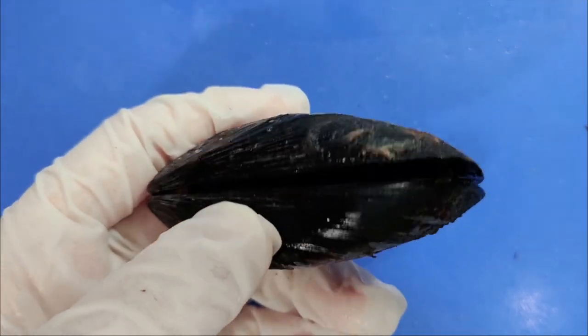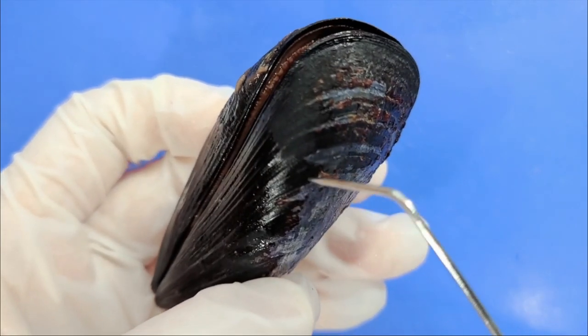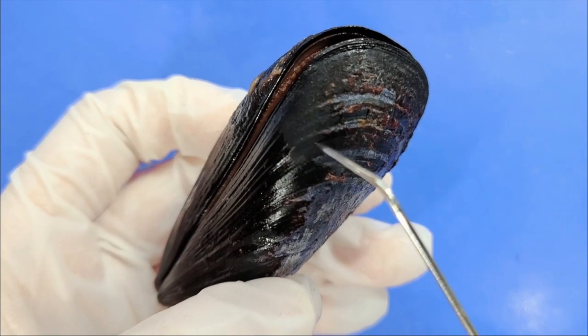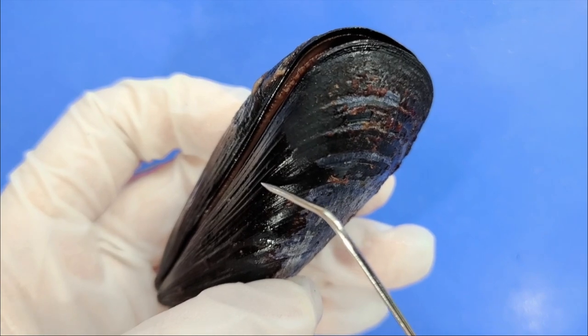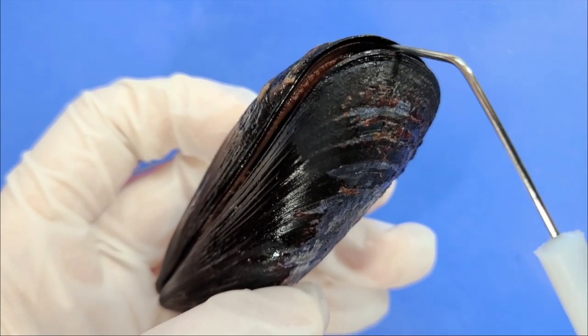The mussel shell also has rings, kind of like a tree. You can see the rings here. You can count the rings to find out how old the mussel is, because the mussel grows its shell by adding growth rings around the edge, so it keeps adding new rings here.